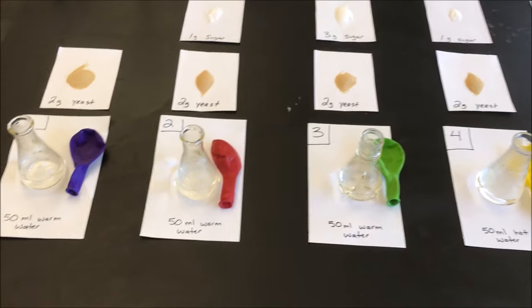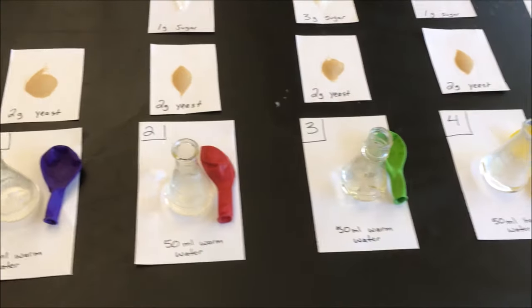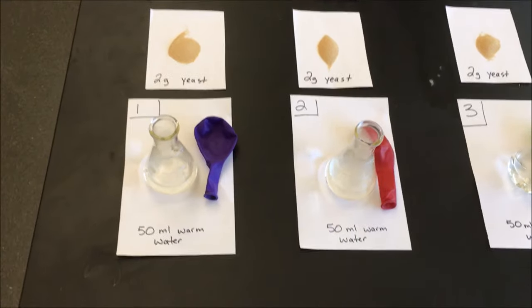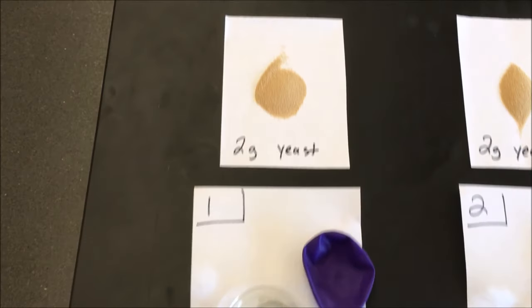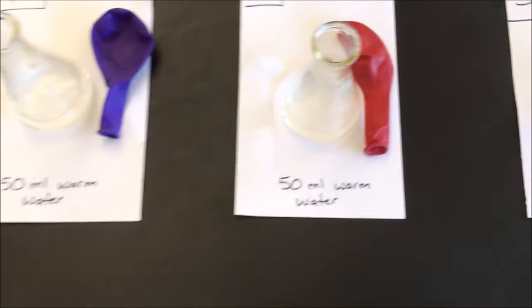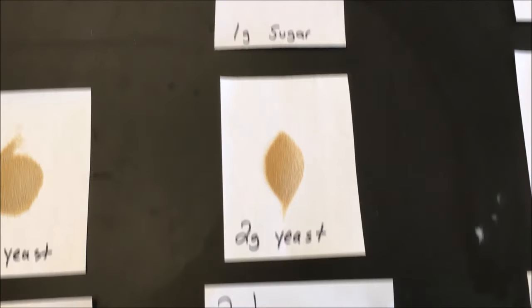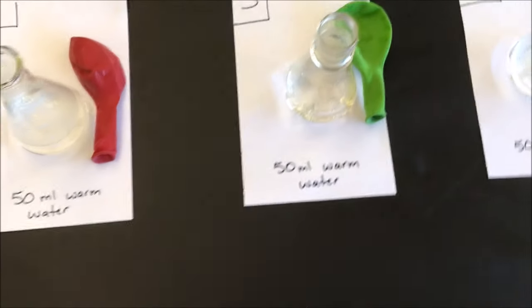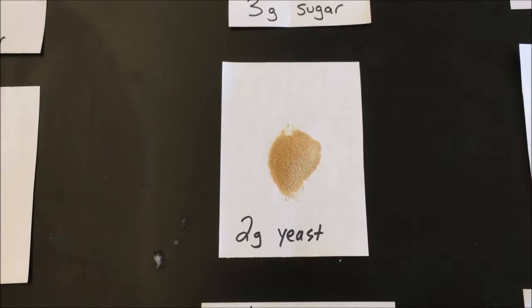Hey everybody, Mr. Coby here, and we're going to do a little experiment. I've got five glass flasks — actually one of them is plastic, but still five flasks. Flask number one has 50 milliliters of warm water and I'm going to add two grams of baker's yeast and mix it up. Flask number two is 50 milliliters of warm water with two grams of yeast and one gram of sugar, mixed up. Flask number three is 50 milliliters of warm water with two grams of yeast and three grams of sugar.